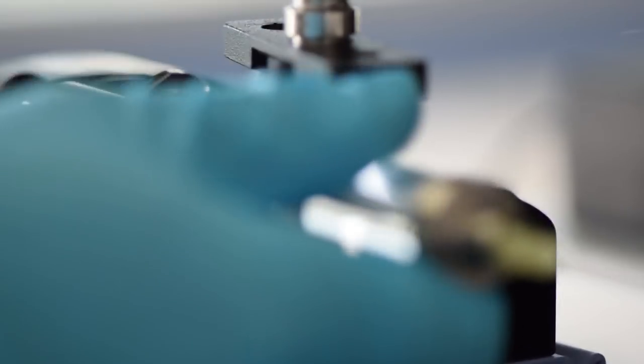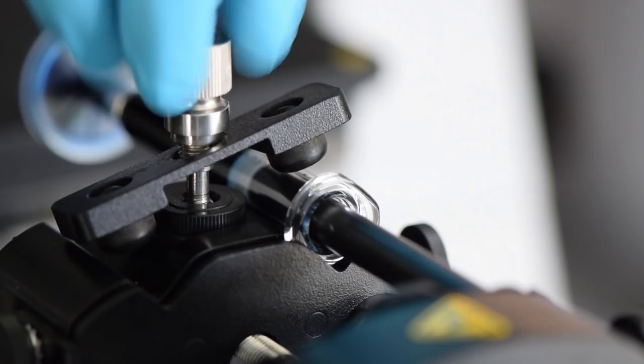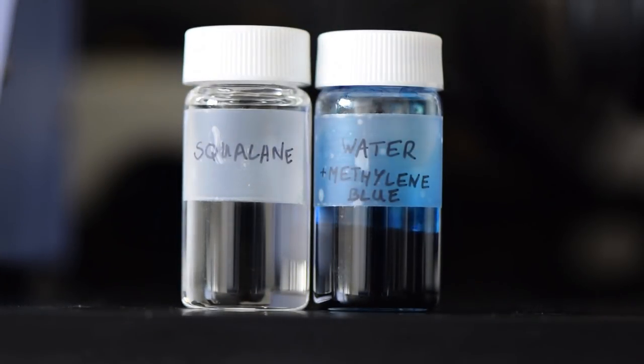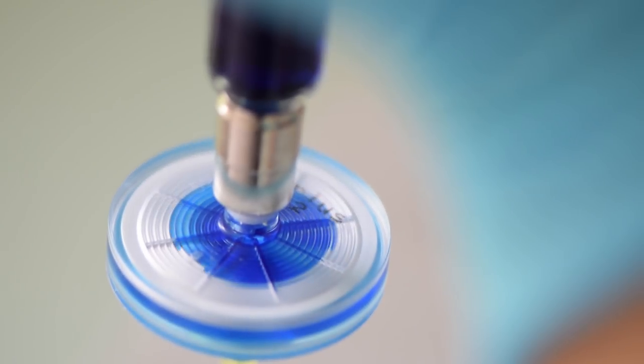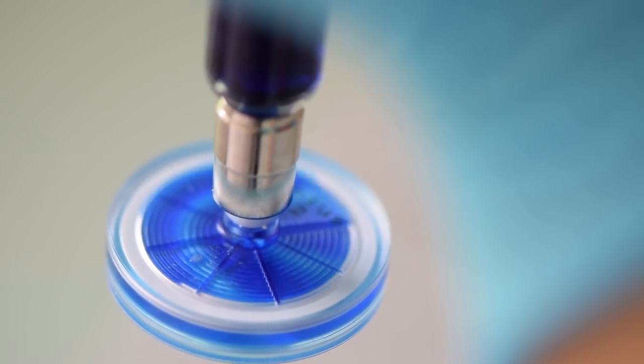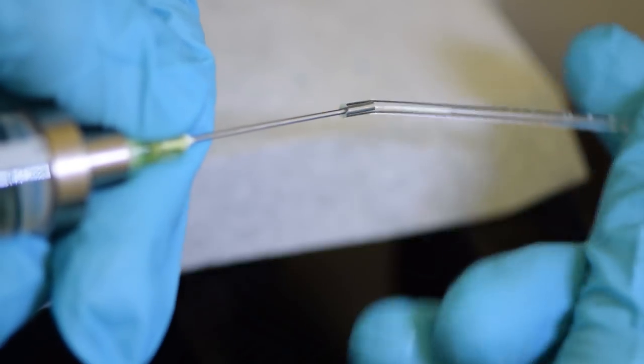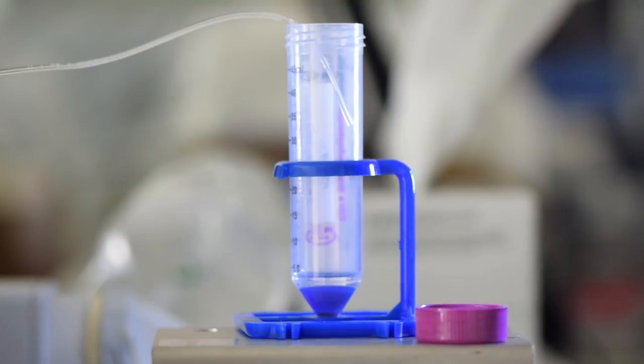Then we're going to put the oil and water in using syringe pumps which control the flow rates of the liquids very precisely. A blue dye was added to the water so we can see it more easily. It's filtered to prevent impurities from clogging up the chip. Then we'll connect the inlets to the two syringes and the outlet to a vial where we'll collect the droplets. Now everything's ready.